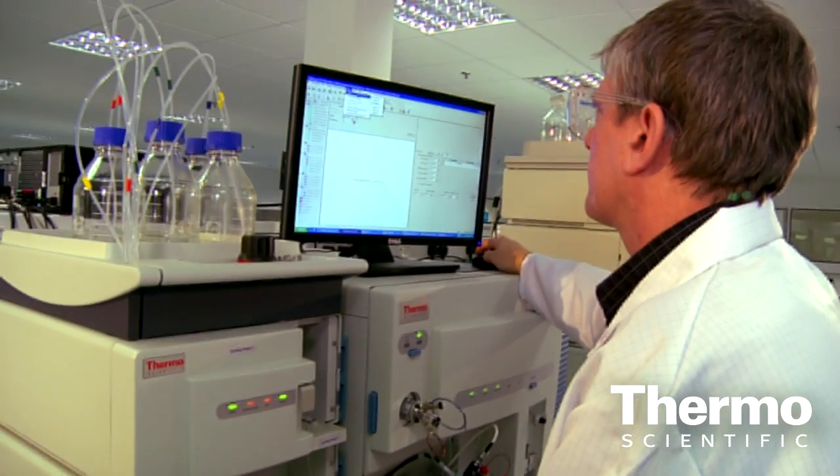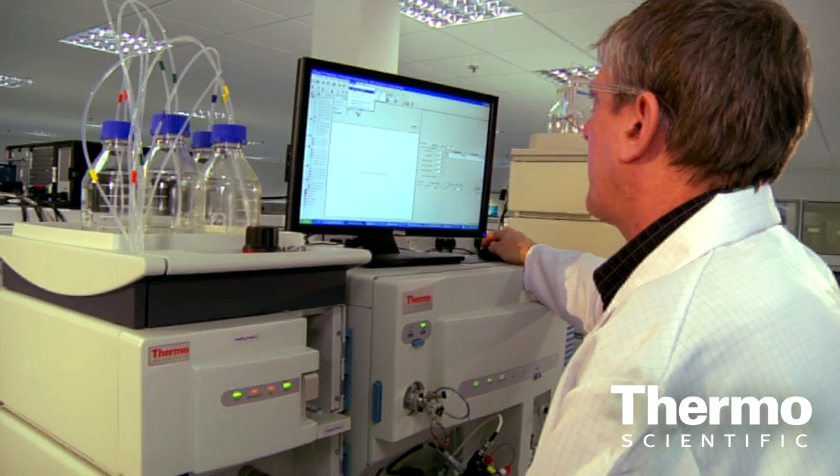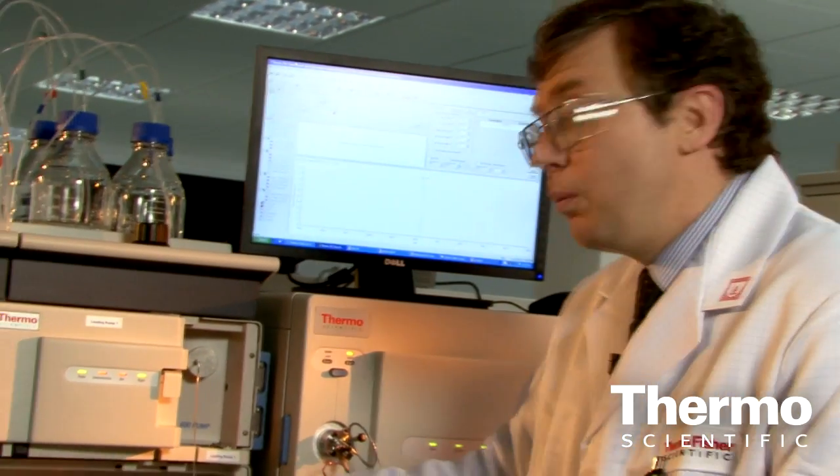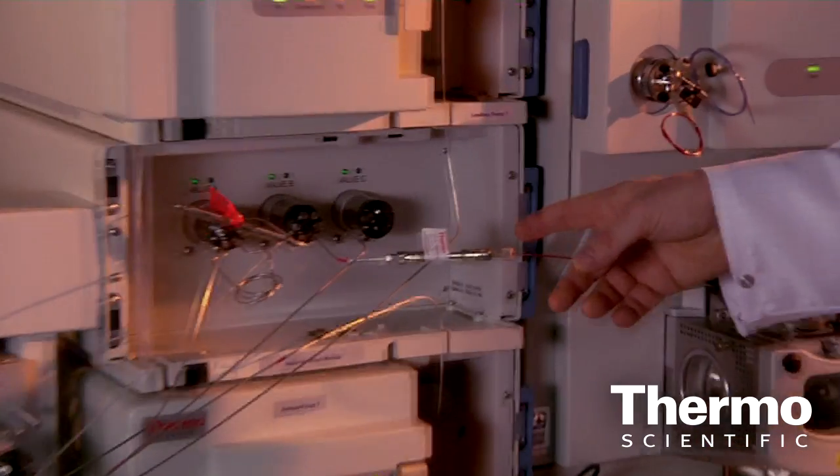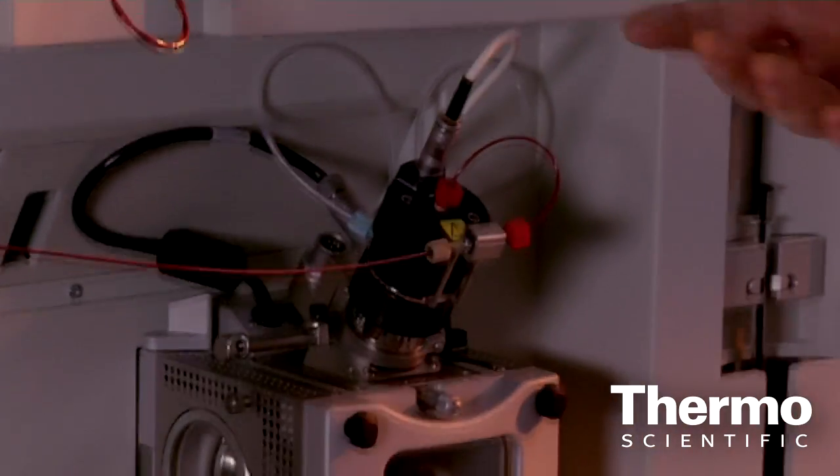And so by separating these components it allows me then to start studying isobaric interference. That is compounds that potentially have the same mass that are co-eluting from my column which I previously wasn't able to do. From here it then goes into the mass spectrometer.